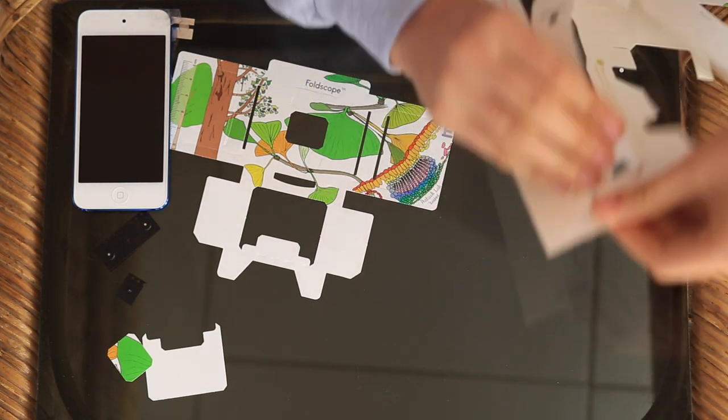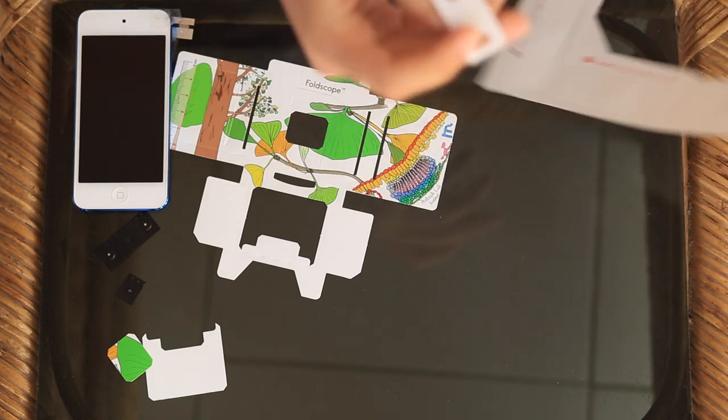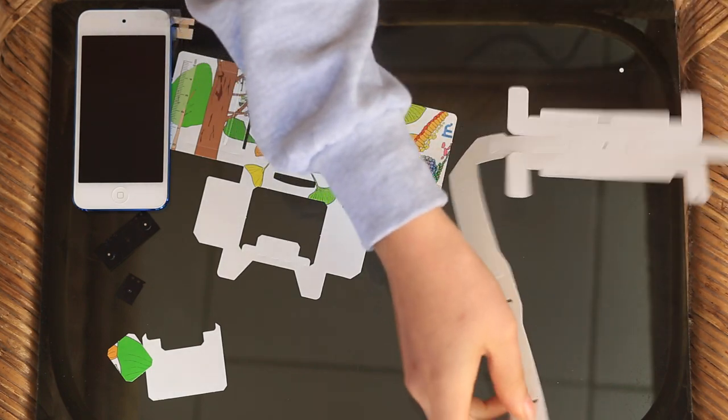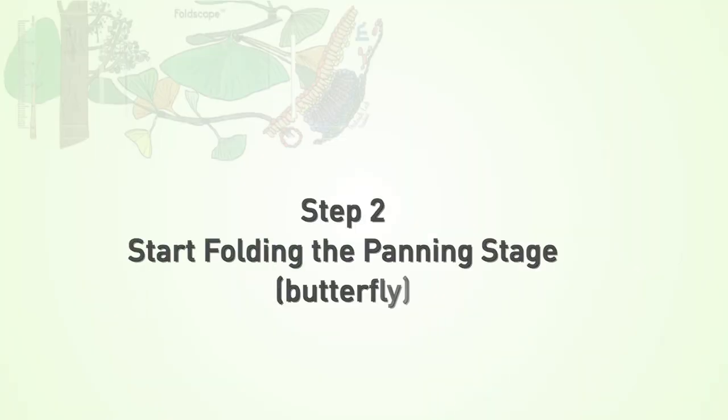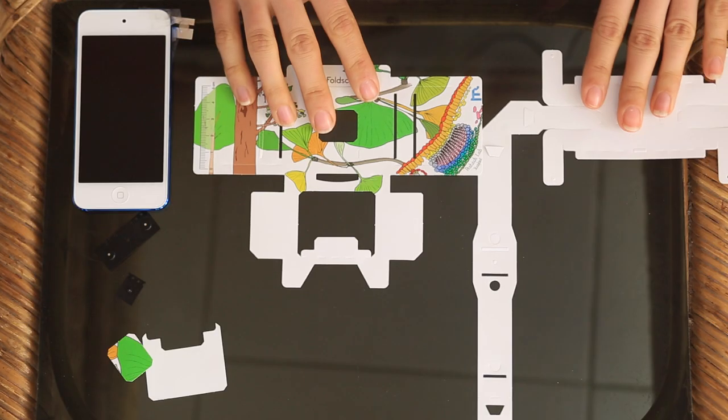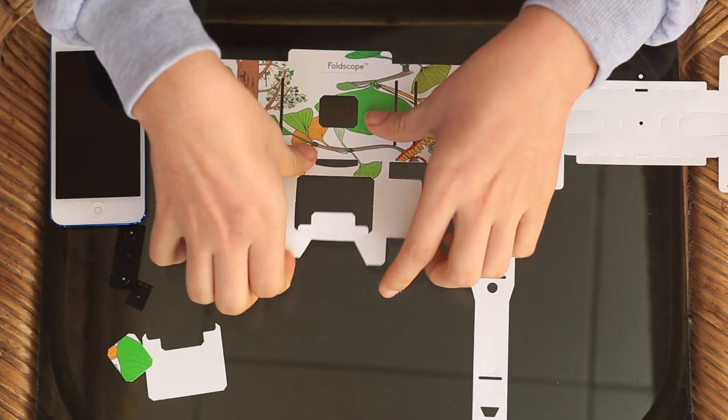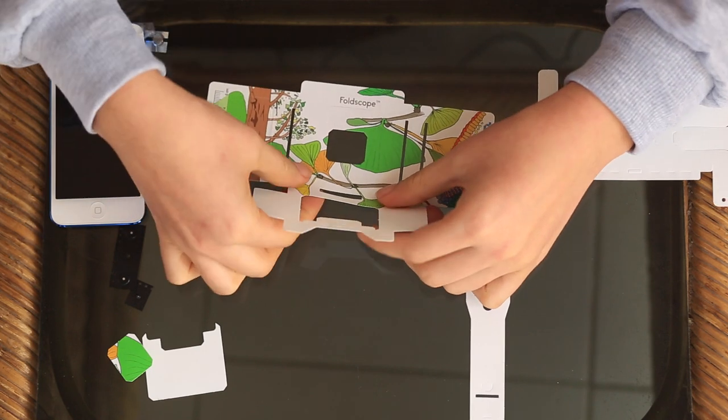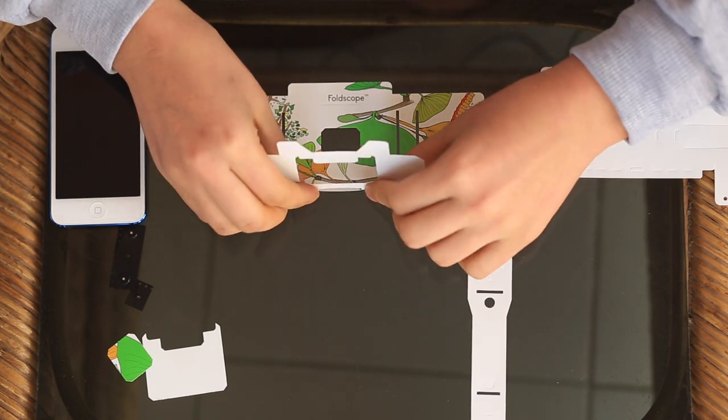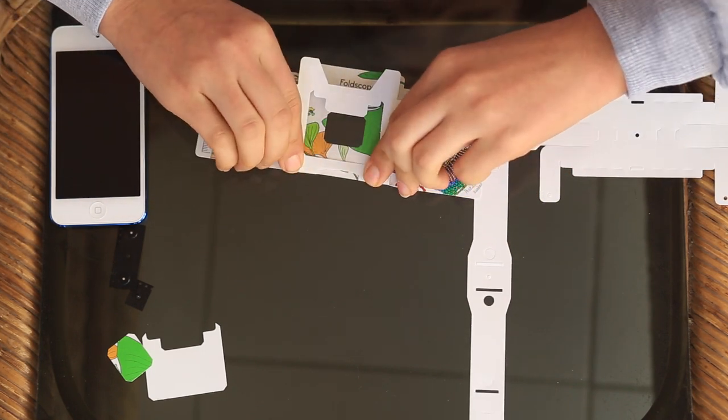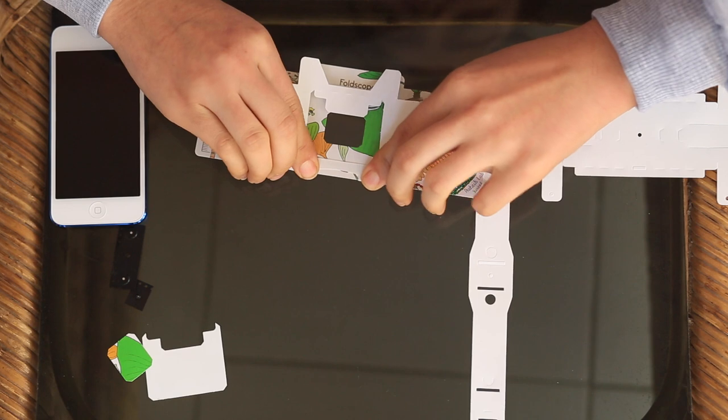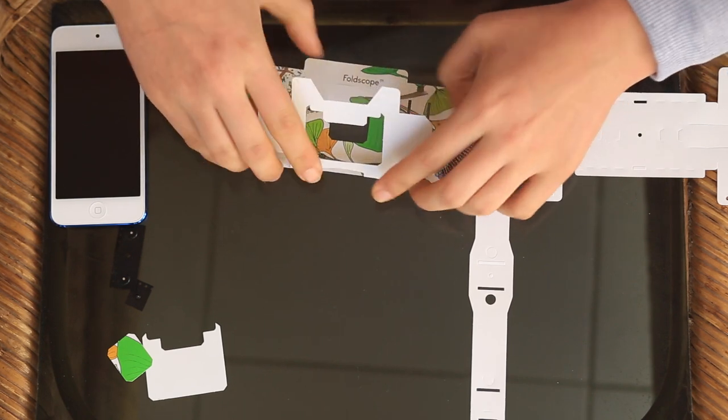So once you have both of your parts completely punched out, you're left with something that looks like this. So the first fold that you make is you fold this part upwards along these back perforations to lie like that.